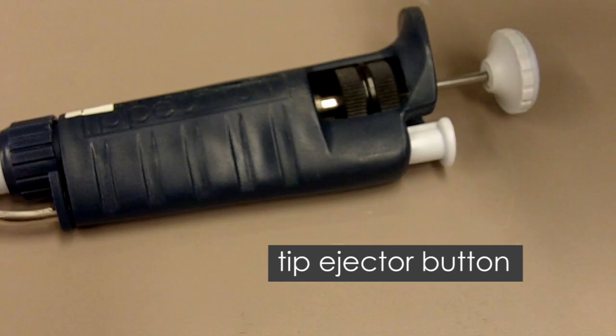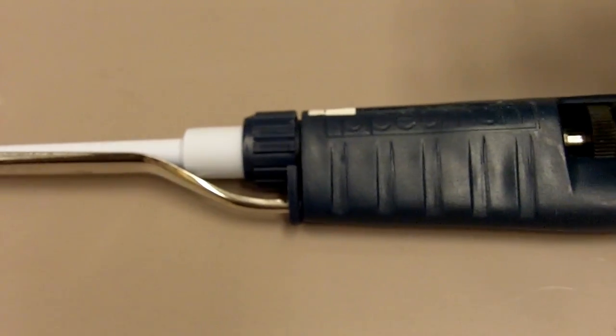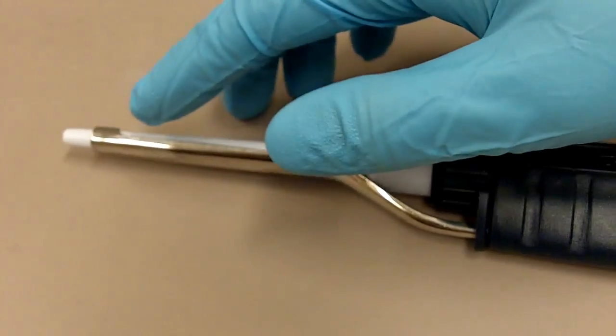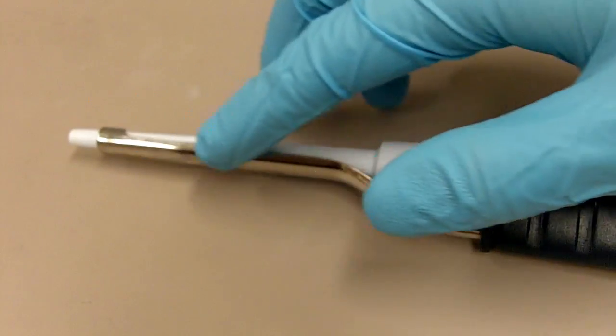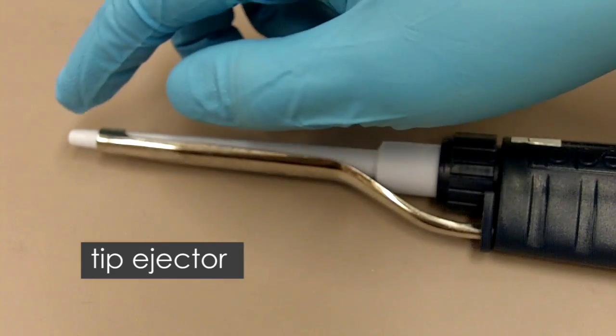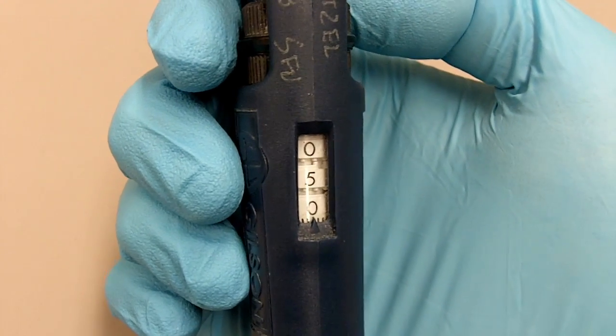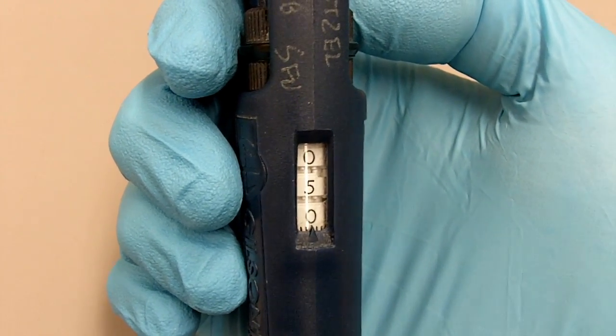So if we look at the end of the pipette, you'll see this middle part right here is the tip ejector and the tip goes on to the end of the pipette. I'm going to go over the basic features of the pipette again in a close-up view.